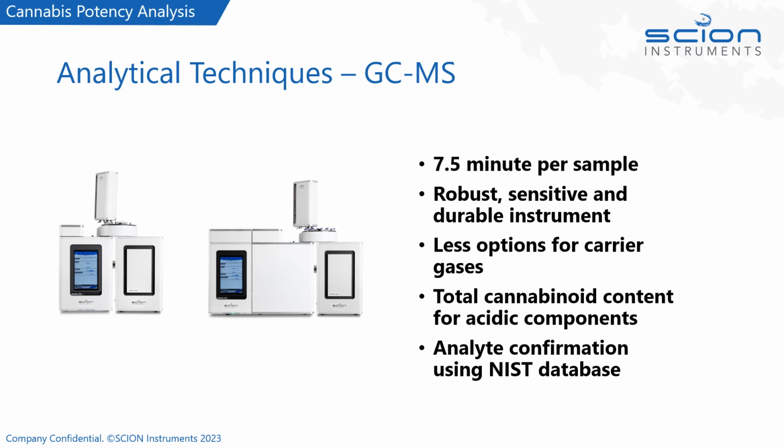The advantages of using GCMS over GC-FID is that we are able to perform analyte confirmation using a built-in NIST database, which is perfect for qualitative analysis and also brilliant for any unknowns that may appear in your samples.